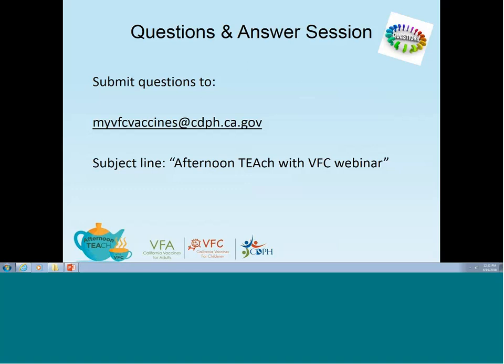And we're also wanting to know if that's possible because some data loggers do not have a summary report. You just have the daily readings that were recorded. The one thing we want to make sure you have the ability to do with your reports, if you do have out-of-range temperatures, is that you're able to calculate how long those vaccines were out of range.